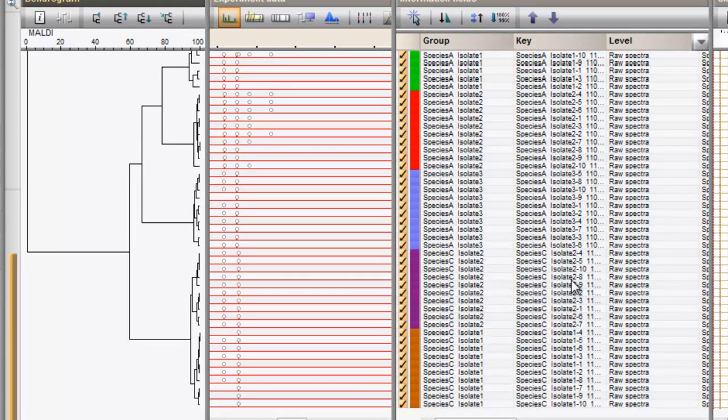In the dendrogram you can conclude that the isolates from Species C are more similar compared to the isolates from Species A and B.